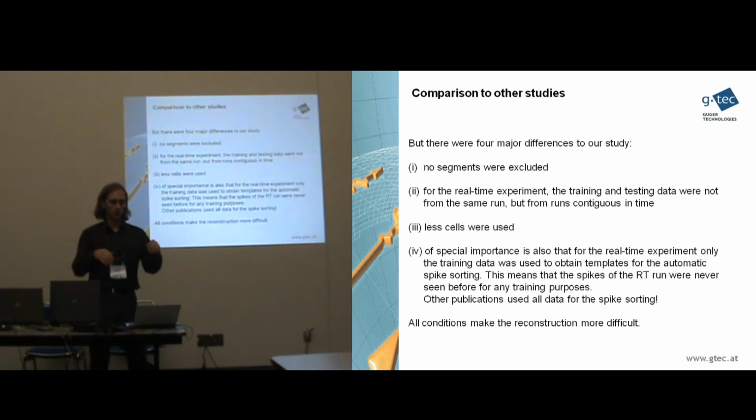So normally you define the environment where you want to do the experiment, and then you place the rat the first time inside. The rat is moving around. The place cells are building up because the rat is learning to know the environment. And after some hours or days of training, the place cells are stable, and then you can do this position reconstruction. And if you change something in the environment, you might destroy these old place cells. So it's depending on how the environment looks like.